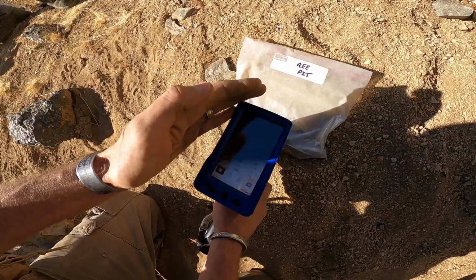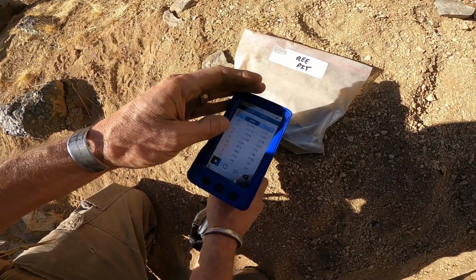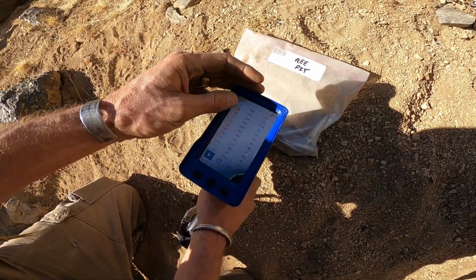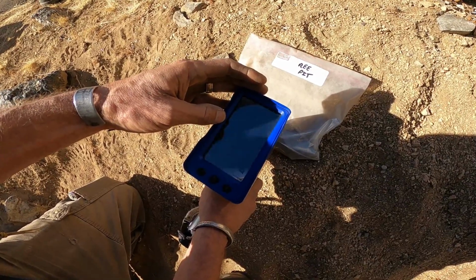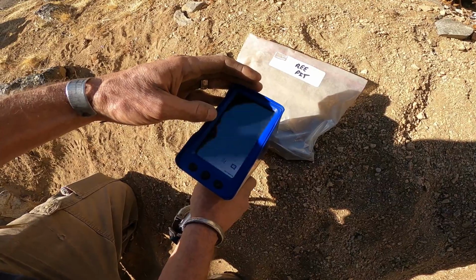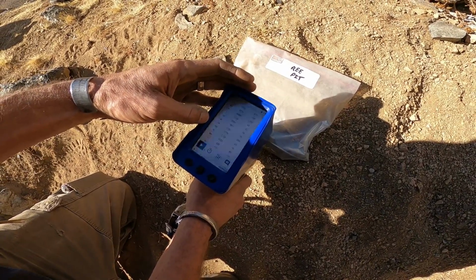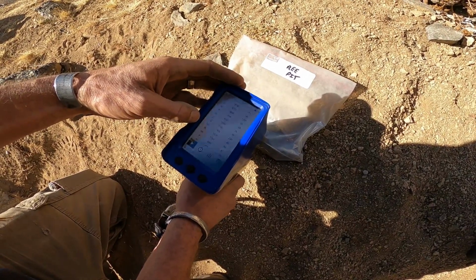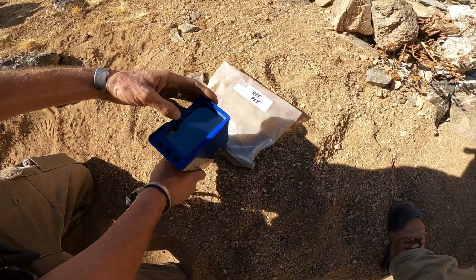All right, so right away, calcium and potassium are kind of a big deal in there. Yttrium is at 3,500, cerium's now at 3,000, so we're already at 6,500 parts per million. Wow, look at that. Lanthanum. I was calling it lathium. It's lanthanum. I'm not a geologist, I can mispronounce those. Neodymium, and then thorium. Those are some great readings.